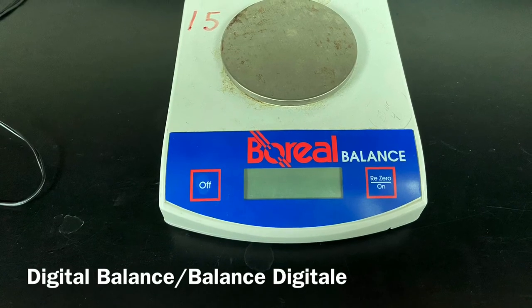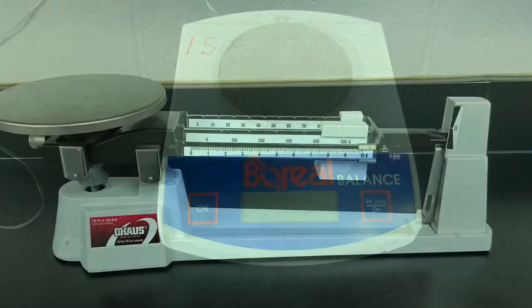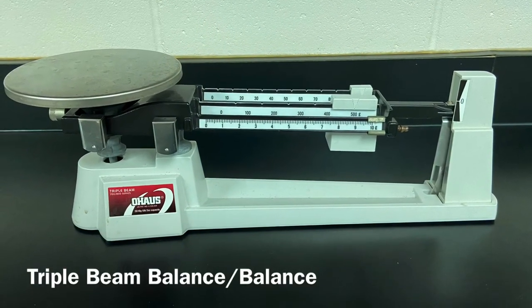Digital balance. Balance digital. Triple beam balance. Balance.